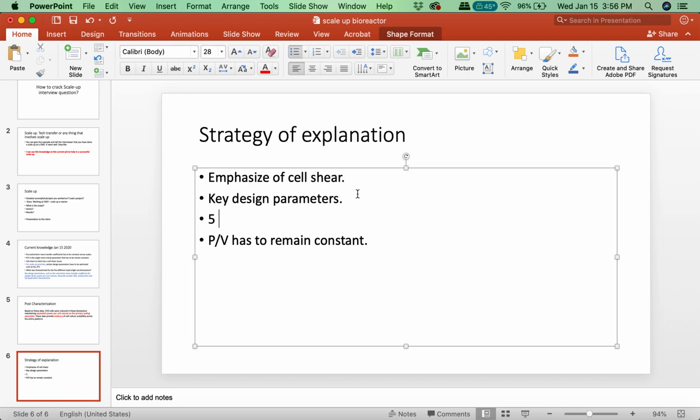So you say, I work with five design parameters: KLA, P over V, tip speed, Reynolds number, and mixing time.